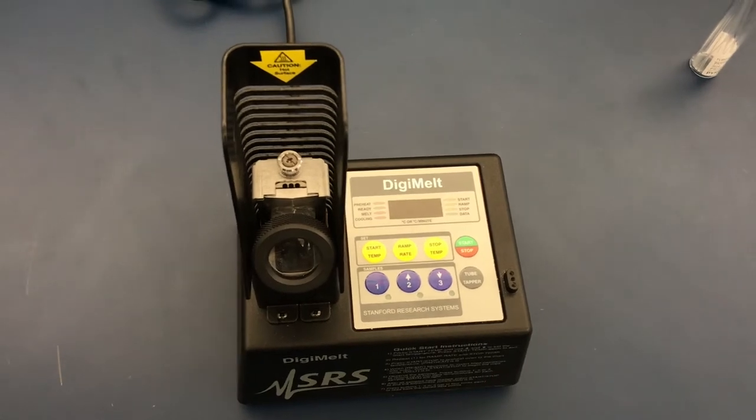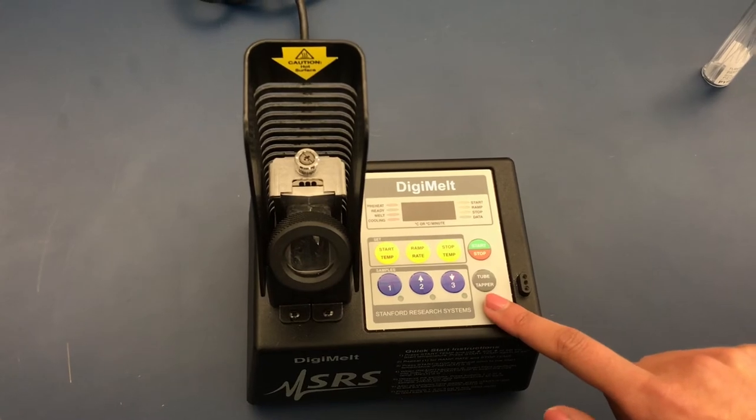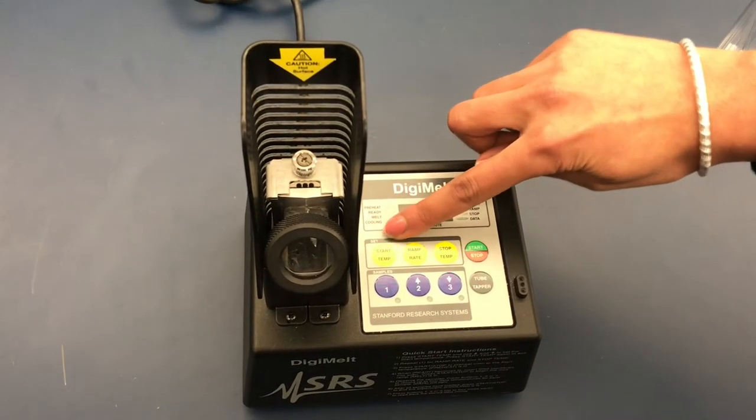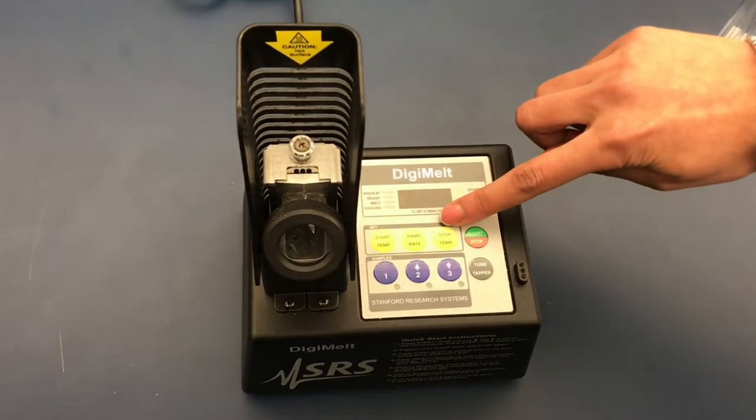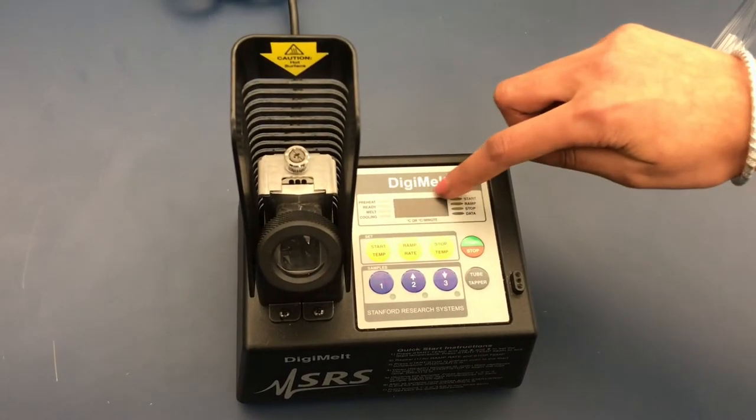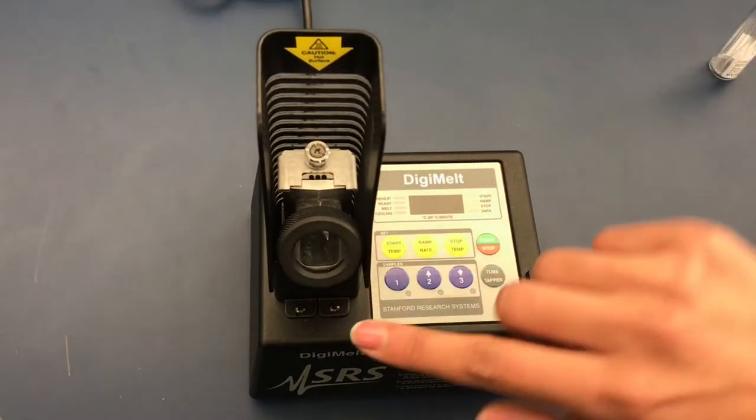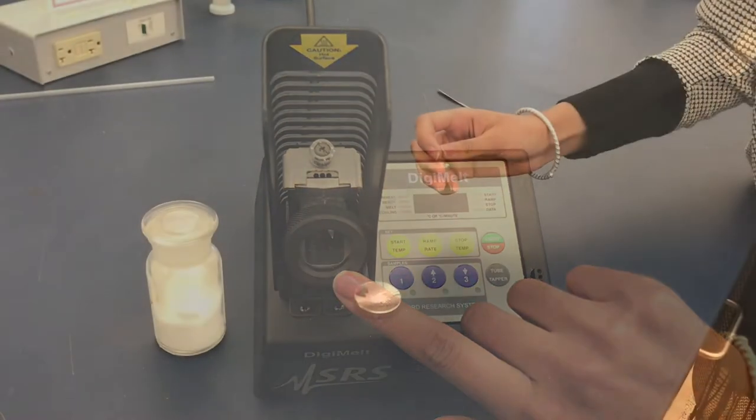The DigiMelt has many parts: the tube tapper with the tube tapper button, the start temperature button, the ramp rate button, the stop temperature button, the start/stop button, indicators for the state of DigiMelt, temperature display, and a place to actually melt the solid which you can look at through a magnifying glass.